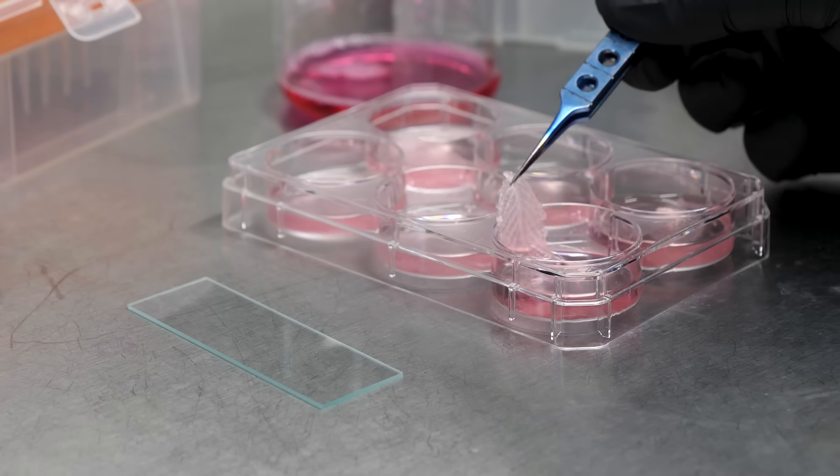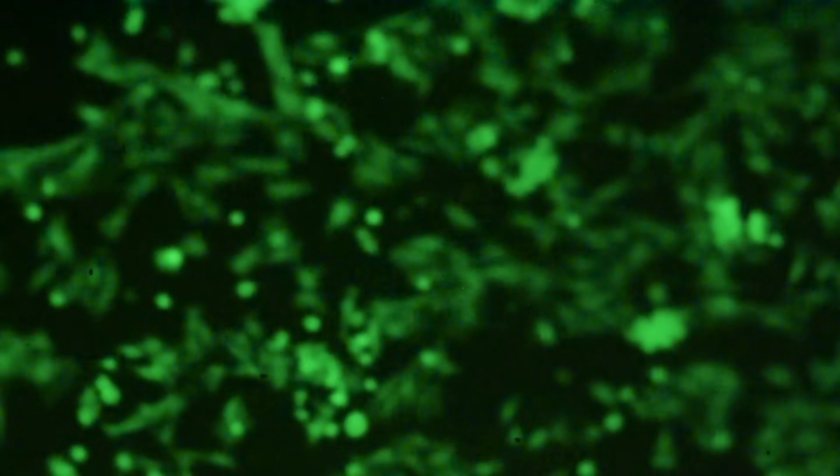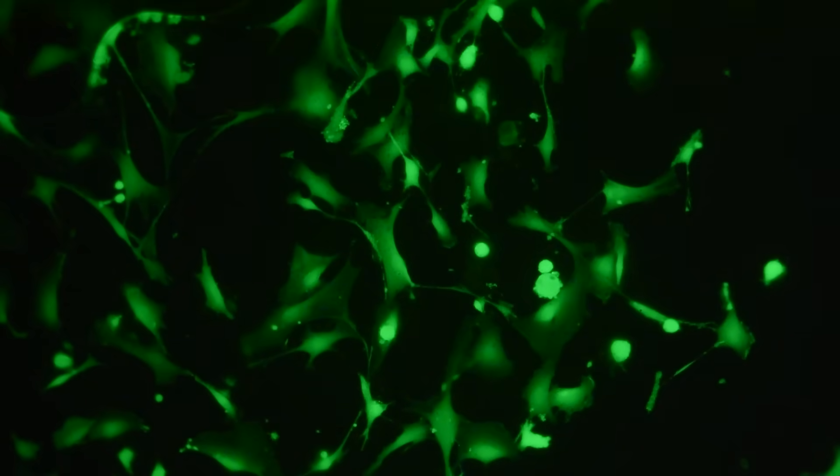Then, I very carefully fished out the leaves and transferred them to a microscope slide for observation. As soon as the slide was in view, it was obvious that this had worked absolutely perfectly. An enormous number of cells can be seen clinging to every surface of the leaf. They seem to really like the edges of things, like the ridge of the vein of a leaf, or the very edge of the leaf, but were just as happy to flatten out and stick to the surface.